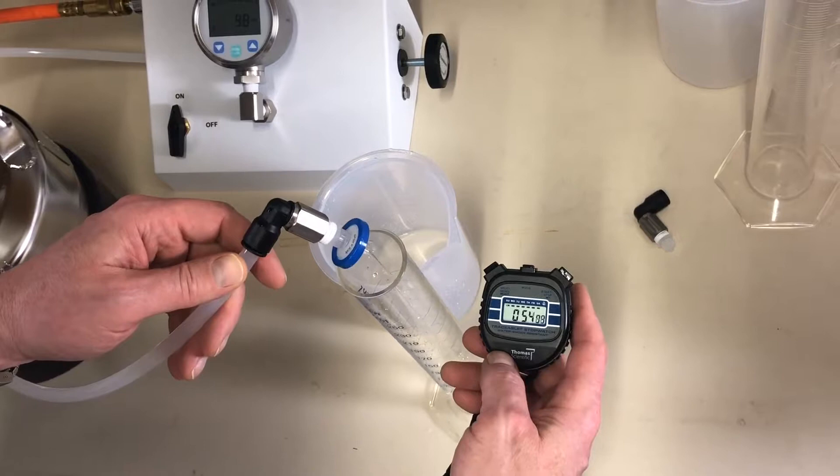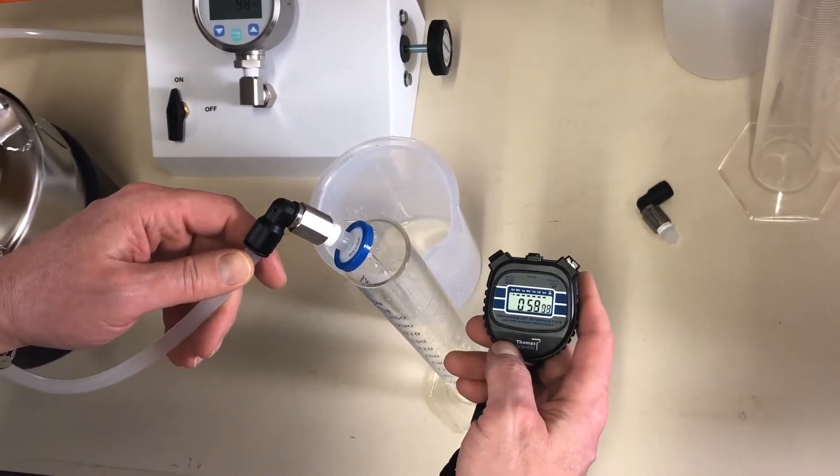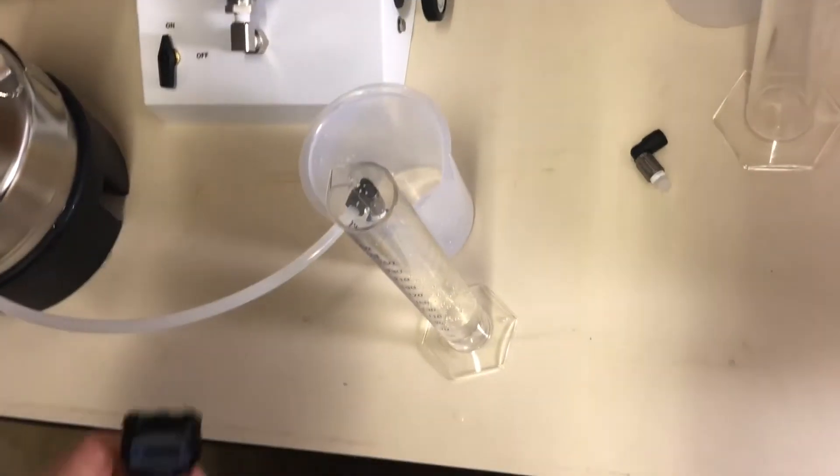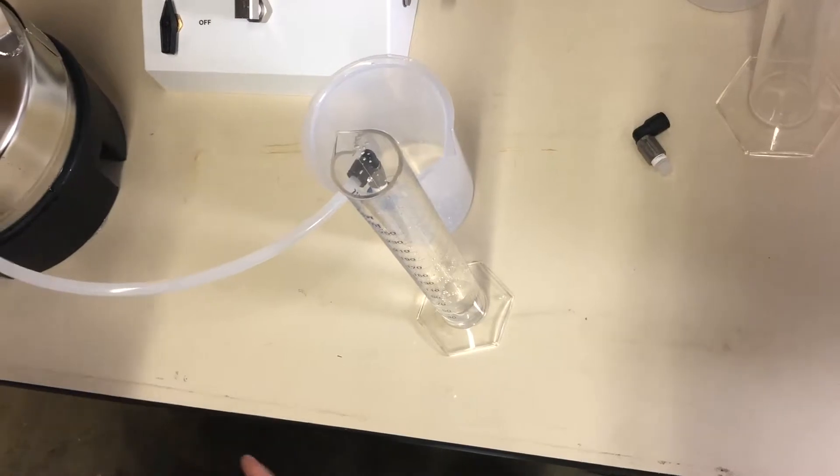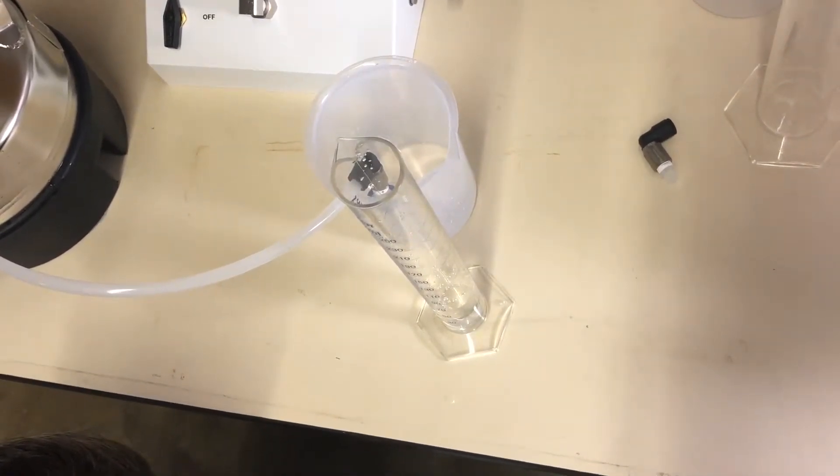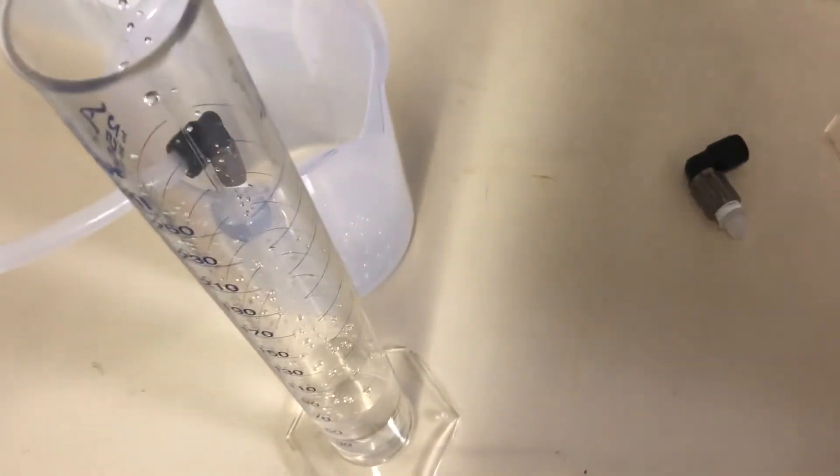So at the end of exactly one minute, we'll remove the filter back to the beaker. And then we'll measure the amount of water collected for one minute, which was 68.